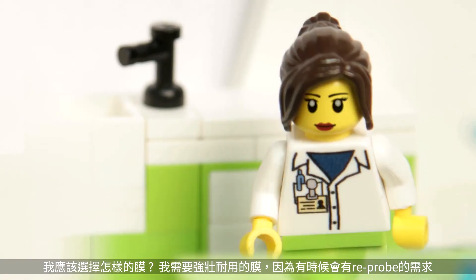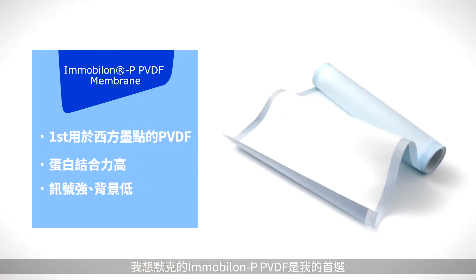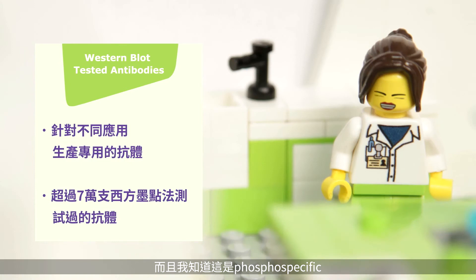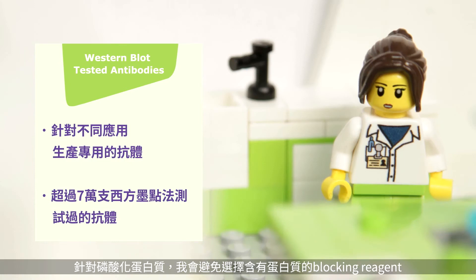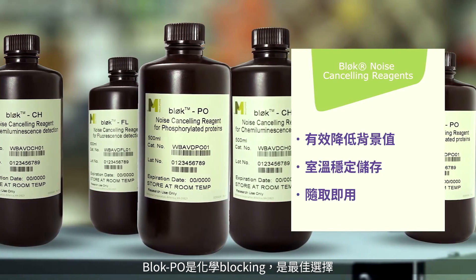Which membrane should I use? I need a strong membrane in case I reprobe, so I'll go with a Mobilon P PVDF membrane. Time to choose my antibody — I'll go with one that's been validated in Western blotting in my cell line, and I know it's phospho specific. For phospho proteins, I should avoid protein-containing blocking reagents, so I'll go with Block PO blocking reagent.